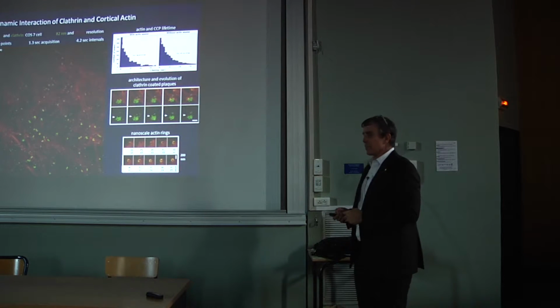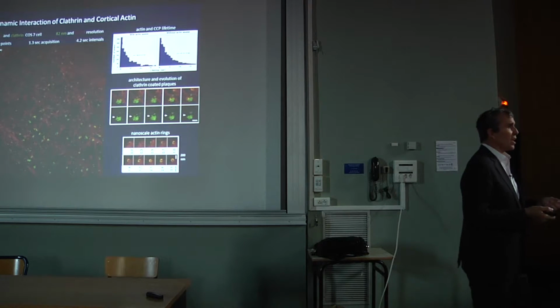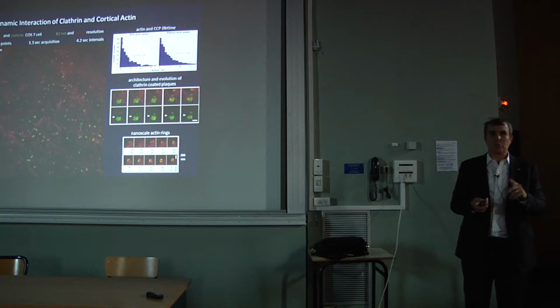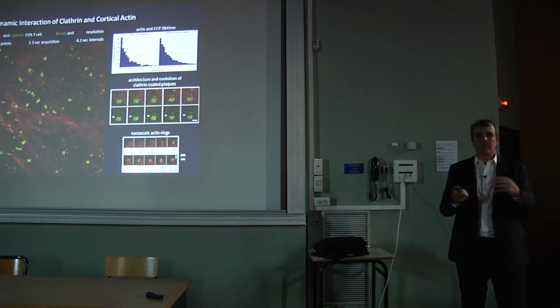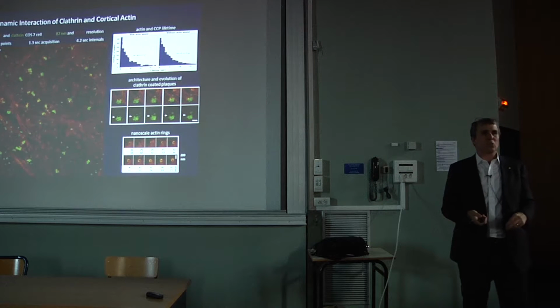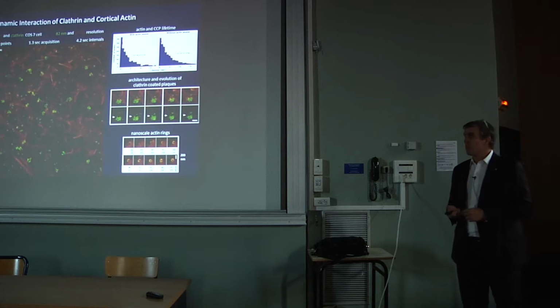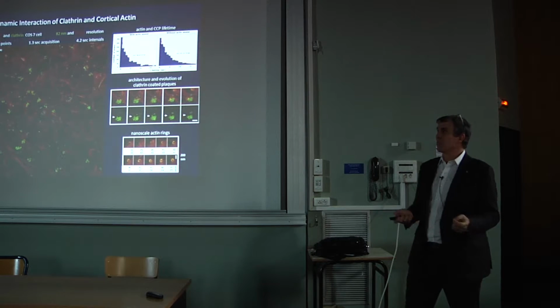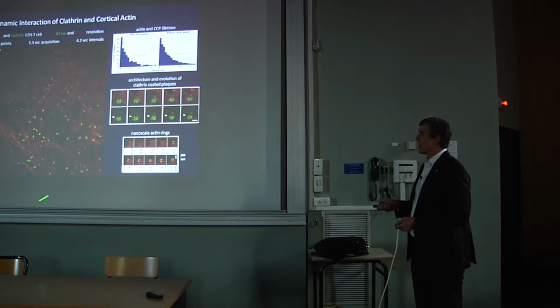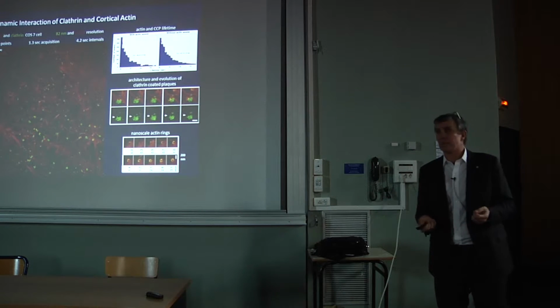So another thing that's nice about SIM as opposed to the other super resolution methods is STED, RESOLFT, PALM, and STORM all require exotic switchable labels or something that can take the gigawatts per square centimeter without immediately going dark. Whereas with SIM, you can use any off-the-shelf fluorescent label, so it's easy to do multicolor imaging. So here's an example where we're looking at a combination of clathrin and actin.